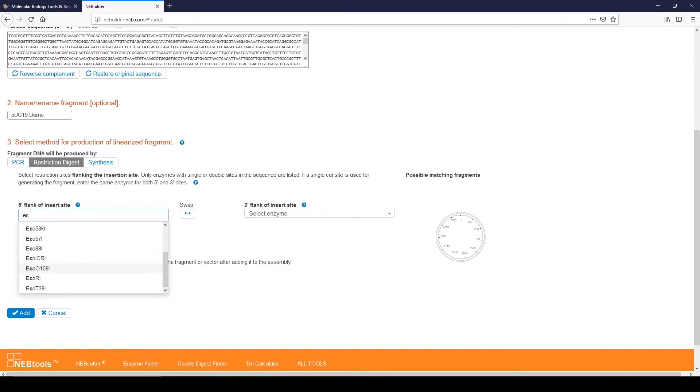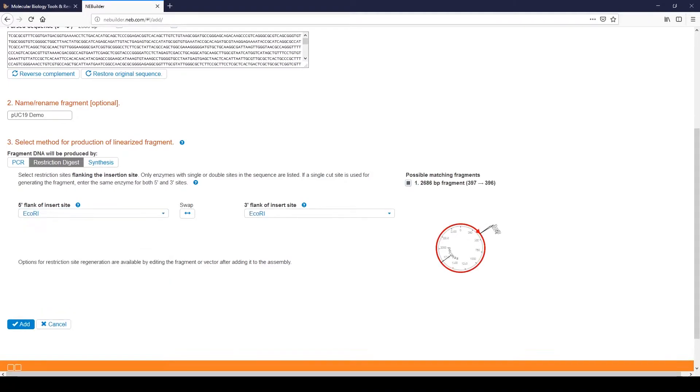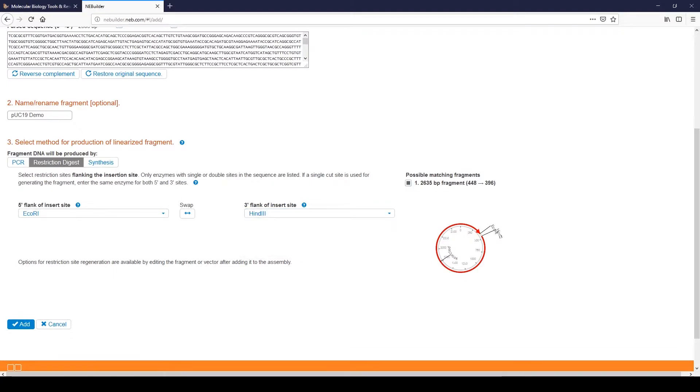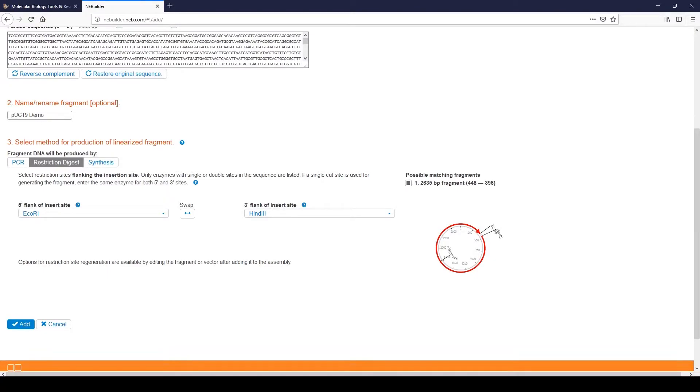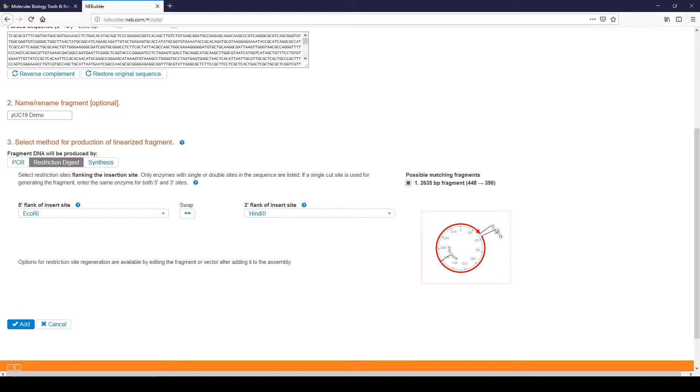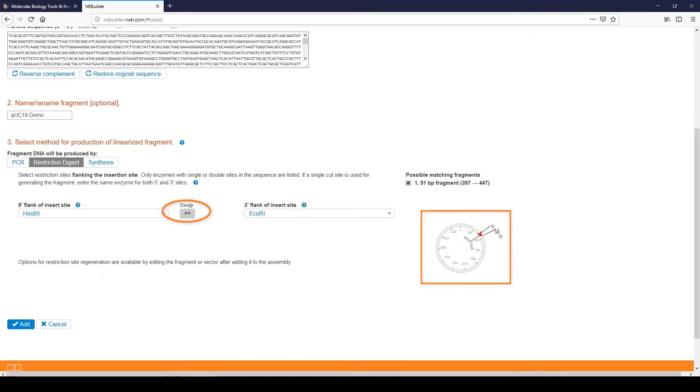Note that only restriction enzymes with one or two sites in the plasmid are available. By convention, the insert fragment will be cloned in the clockwise direction with the 5' end of the insert joined to the 5' end of the vector and the 3' end of the insert joined to the 3' end of the vector. In this case, the upstream 5' site is ECO-R1 and the downstream 3' site is HINDI-3. Once you have selected the restriction enzyme sites, the map in the upper right will show the digested plasmid. You can use the Swap button to change the upstream and downstream sites. Notice how the plasmid map changes when the restriction enzyme sites are swapped. Click Add.